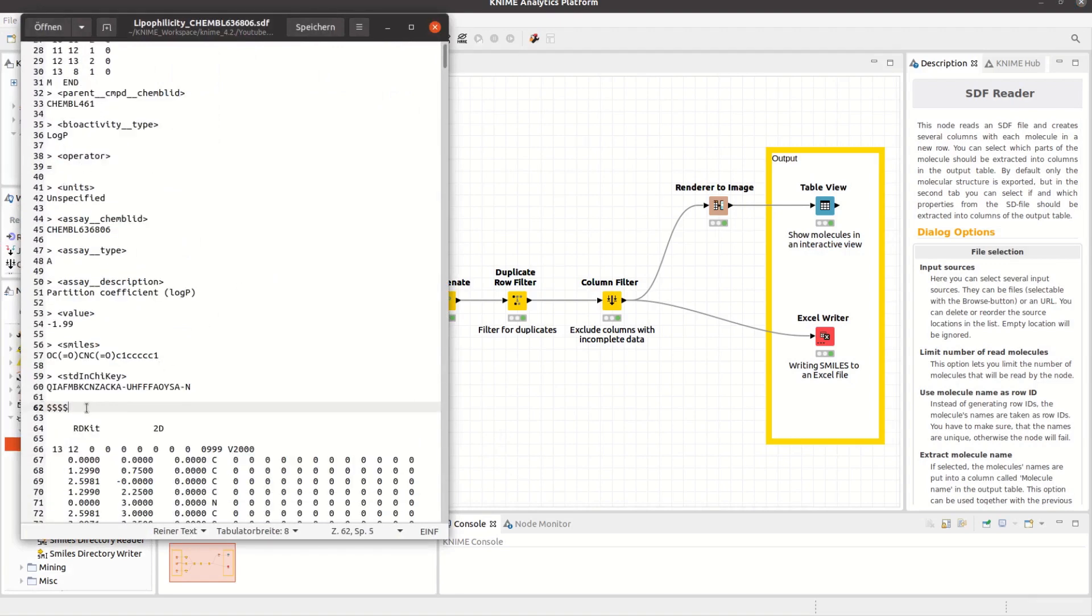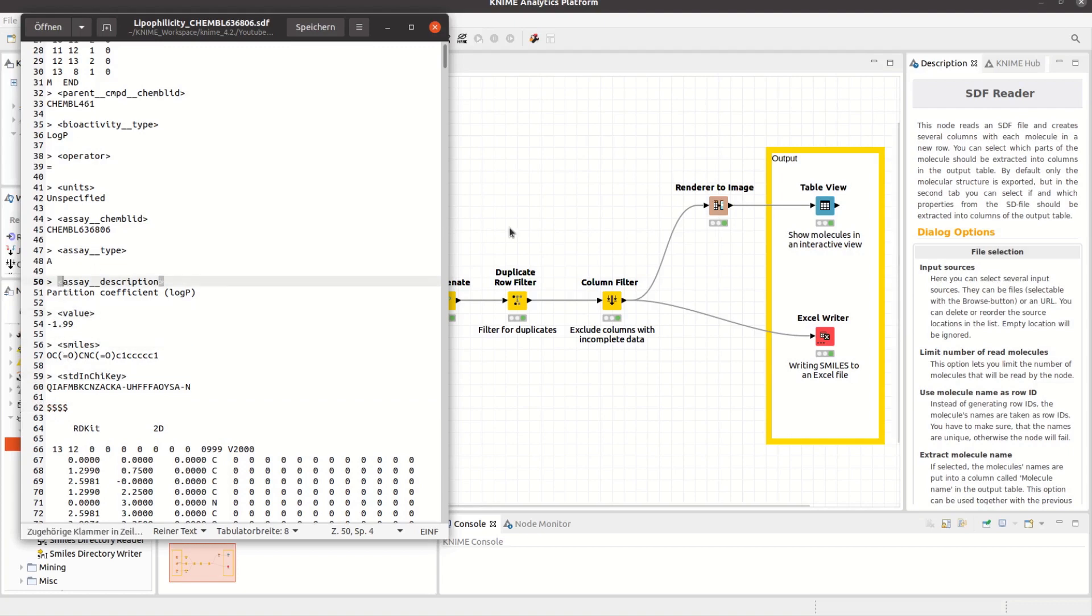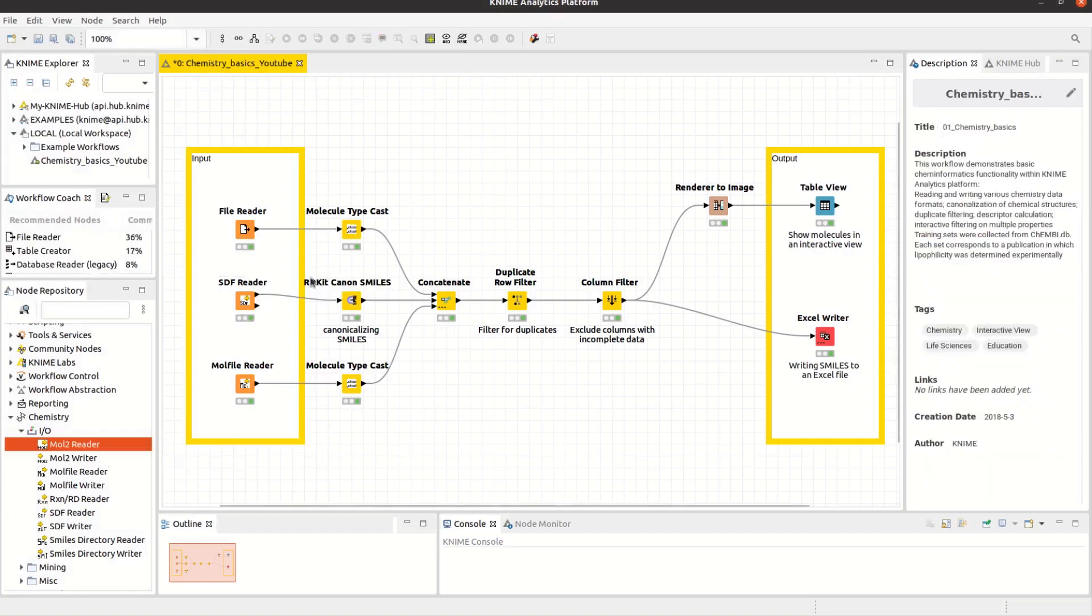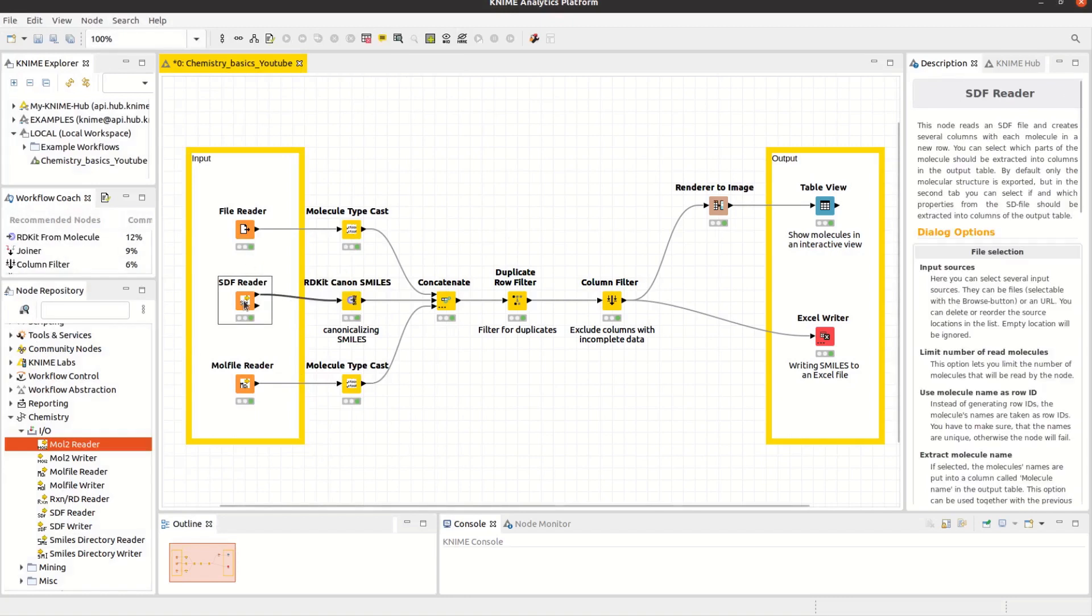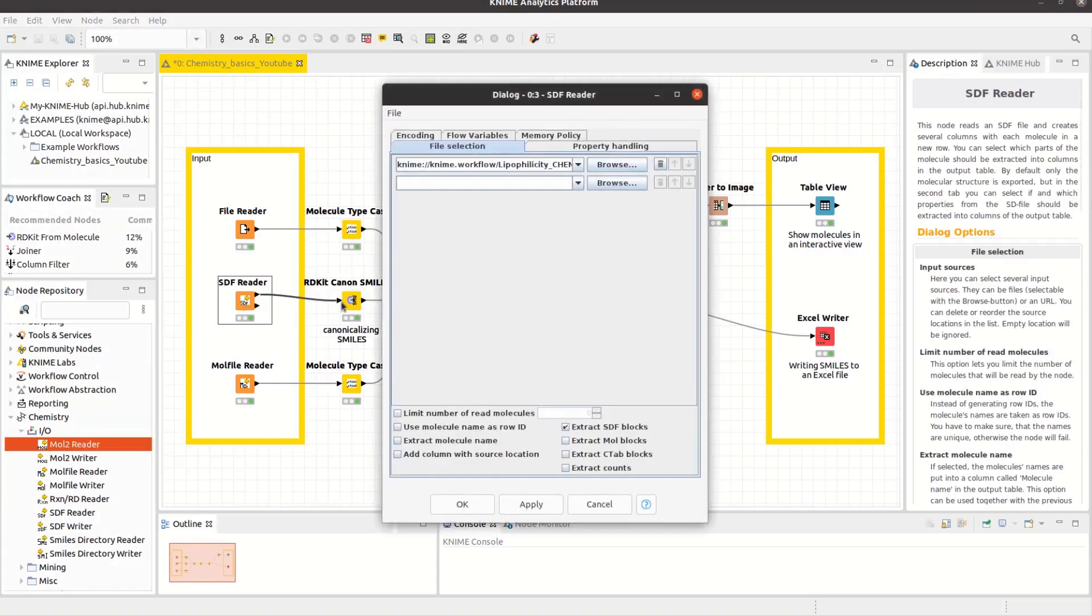It can also include associated data items, which are declared within angle brackets. You can set the node to read these data items by selecting to extract different types of blocks. In the configuration of the node, you can select several input sources, including URLs.